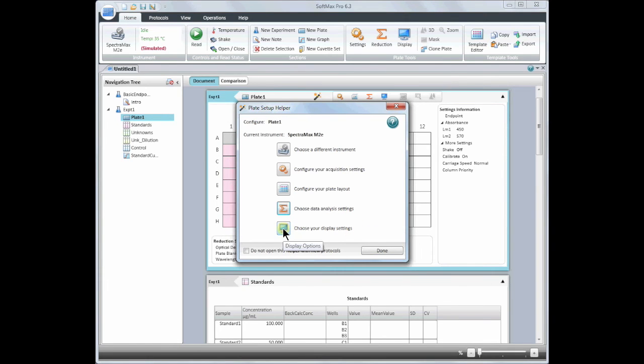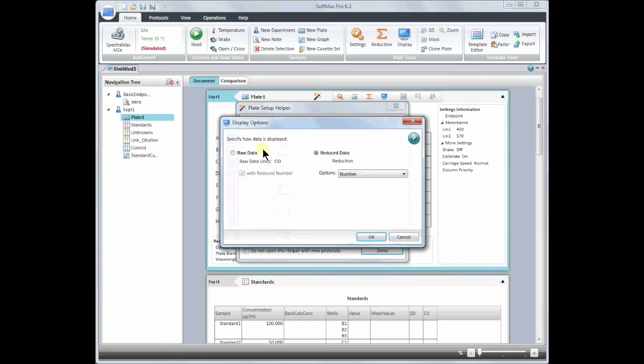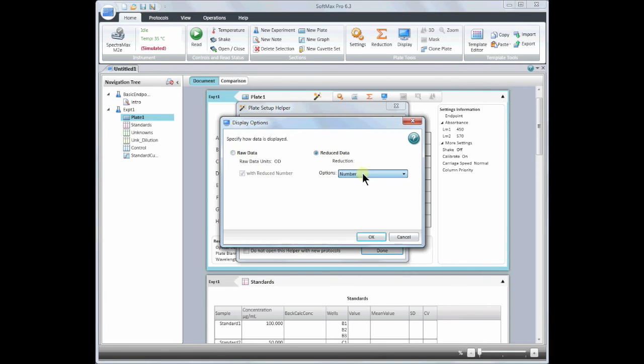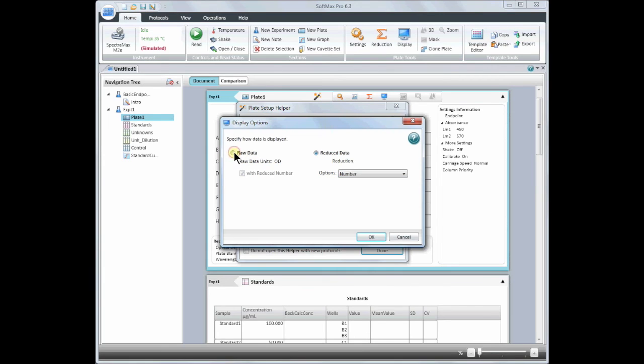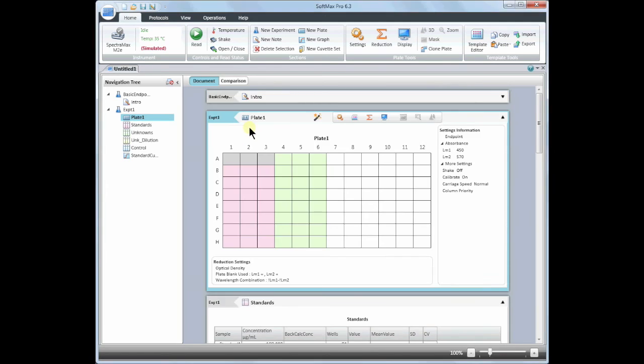Finally, we will choose the display settings. You may view your data as raw data, with or without the reduced value, or reduced data alone as a number or color. This too can be changed after you read the plate. Your raw data will always be saved with your SoftMax Pro file. To read your plate, simply click on the green Read button.